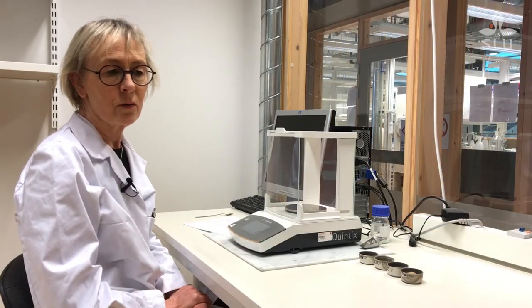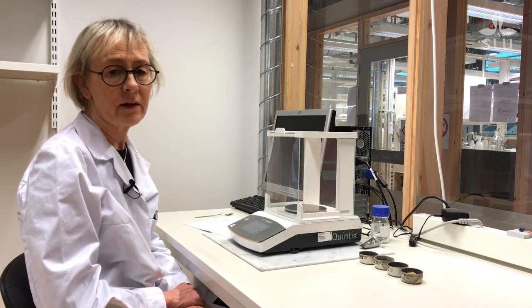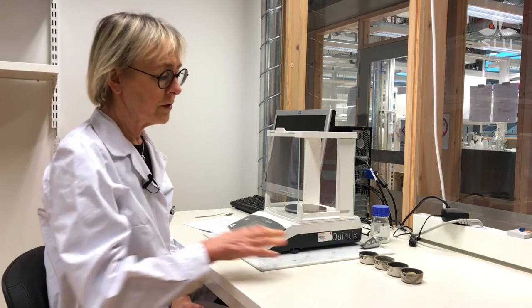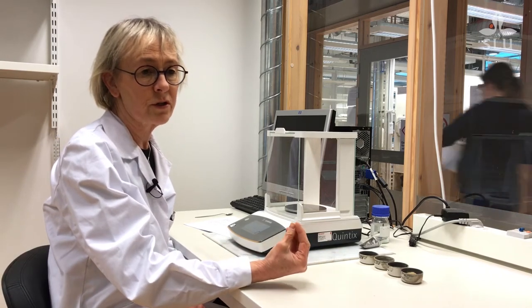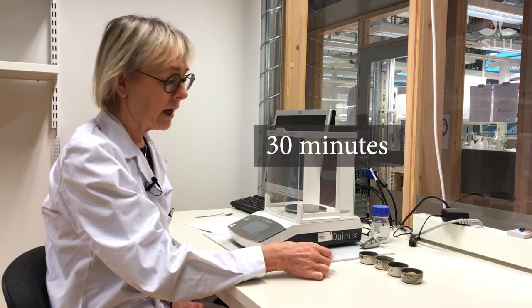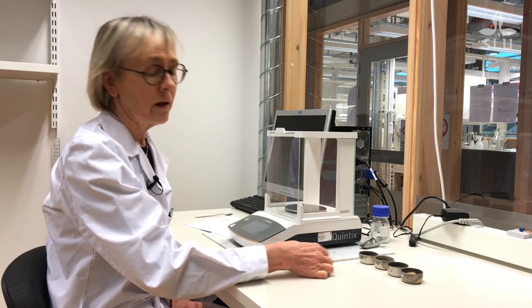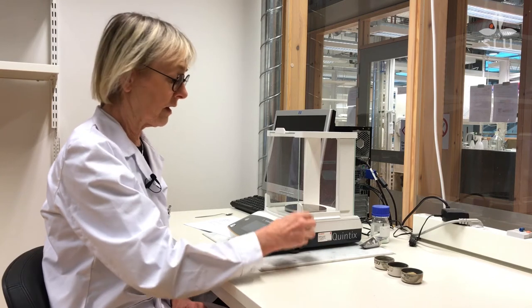It's very important to weigh the crucibles directly when you take them out from the desiccator. Because if you leave them out in the air, they will absorb moisture from the air. These samples have been out for about 30 minutes, and now I want to weigh them again to show you that they have been a little bit heavier than they were before.